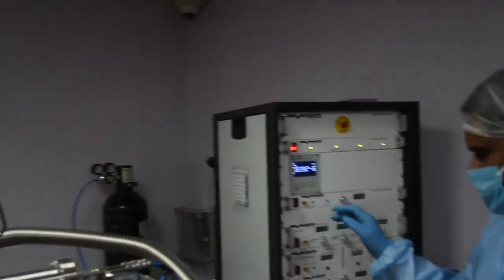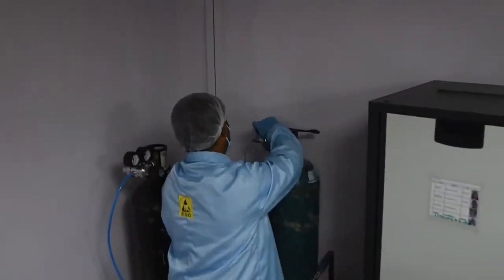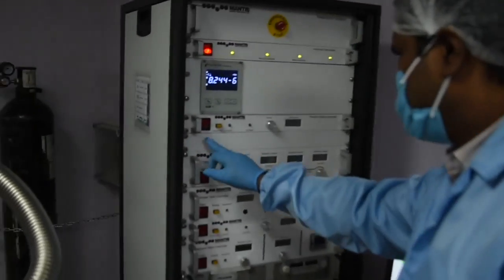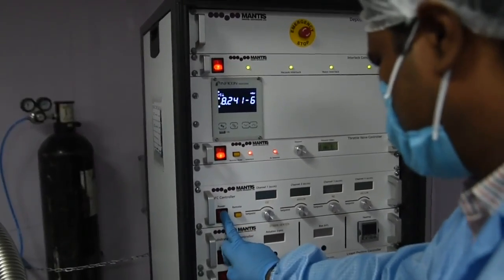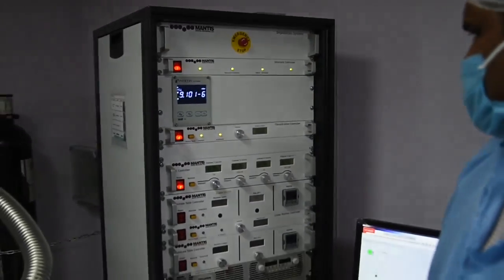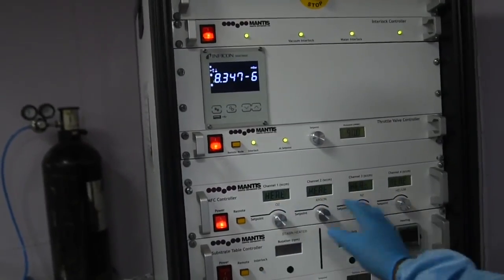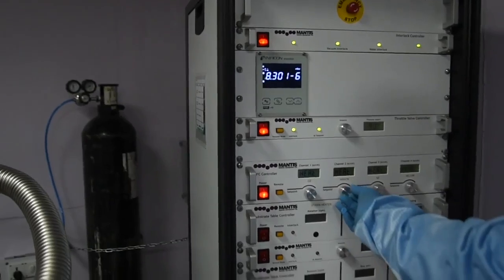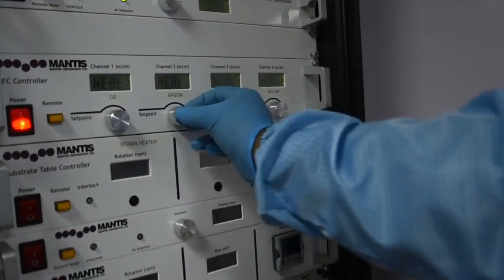Now it is time to introduce the argon gas flow. Once the argon gas inflow is turned on, we turn on the throttle valve controller and also the MFC controller. These are the channels for oxygen, argon, nitrogen, and helium, depending upon the requirements. I have now inserted the argon flow, and by means of this we can regulate the argon flow inside the chamber.